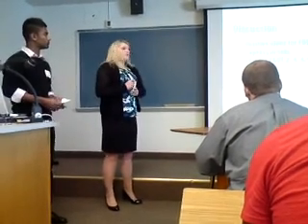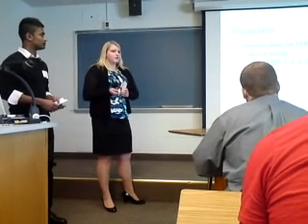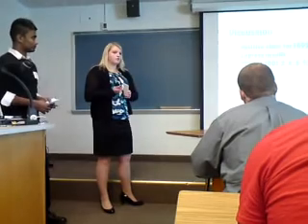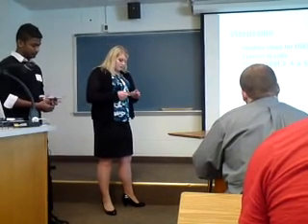Another big thing that we'd work on is we'd go back to the beginning again and try to change some of the conditions and re-PCR amplify FGD1, 2, 4, and 5, since both times we were unable to get results for those molecules.